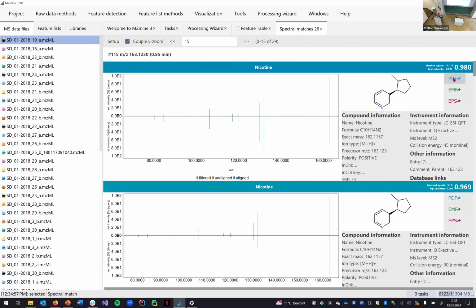From here, you can also, for example, export this as a PDF file in case you were doing a report. But if you want to go into this more deeply, then we have a lot of other videos from other workshops on YouTube. You can just search for that, or you can look at the MZmine documentation.